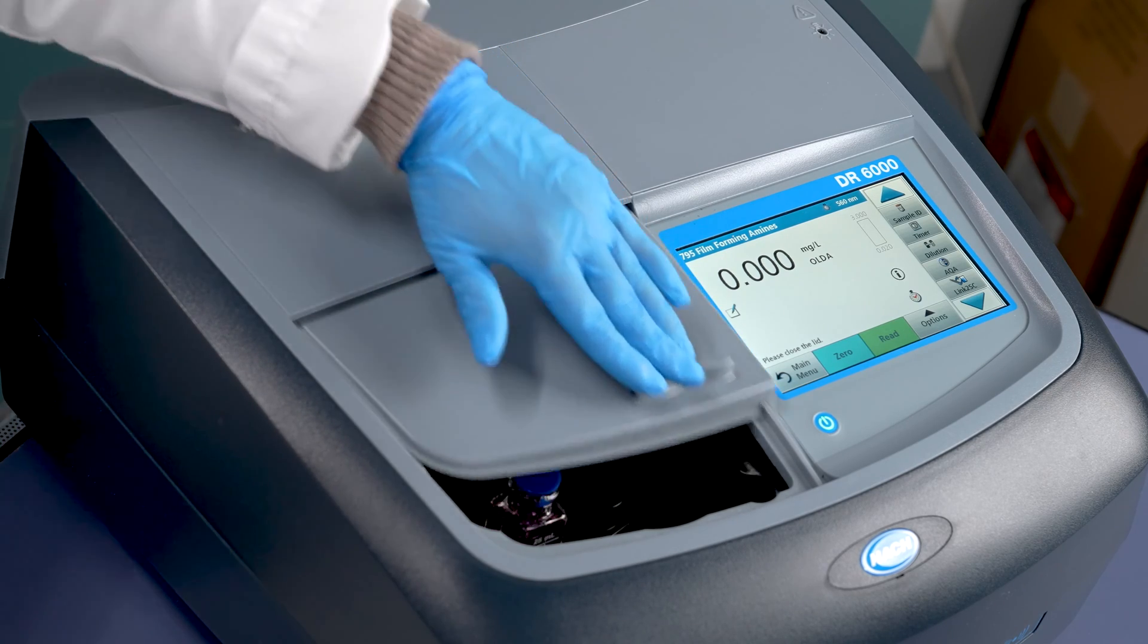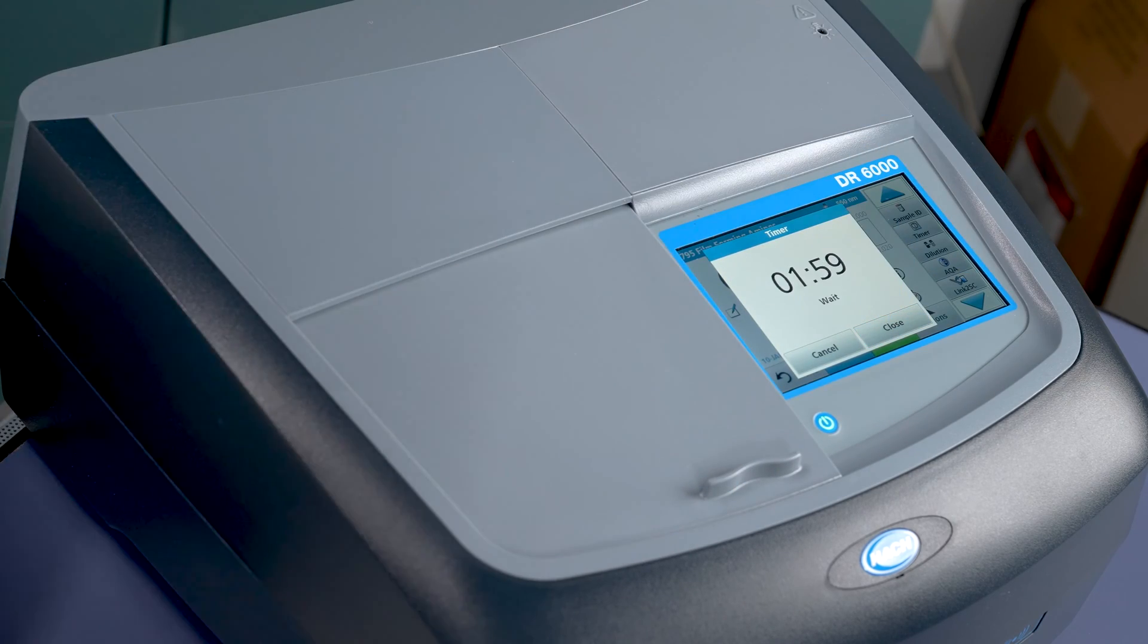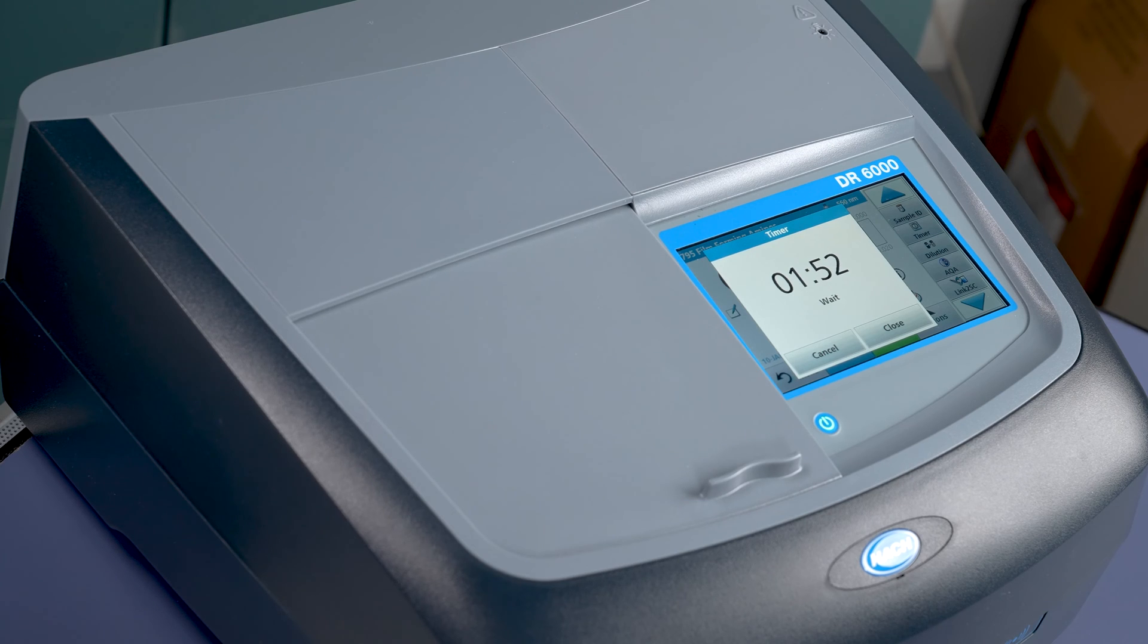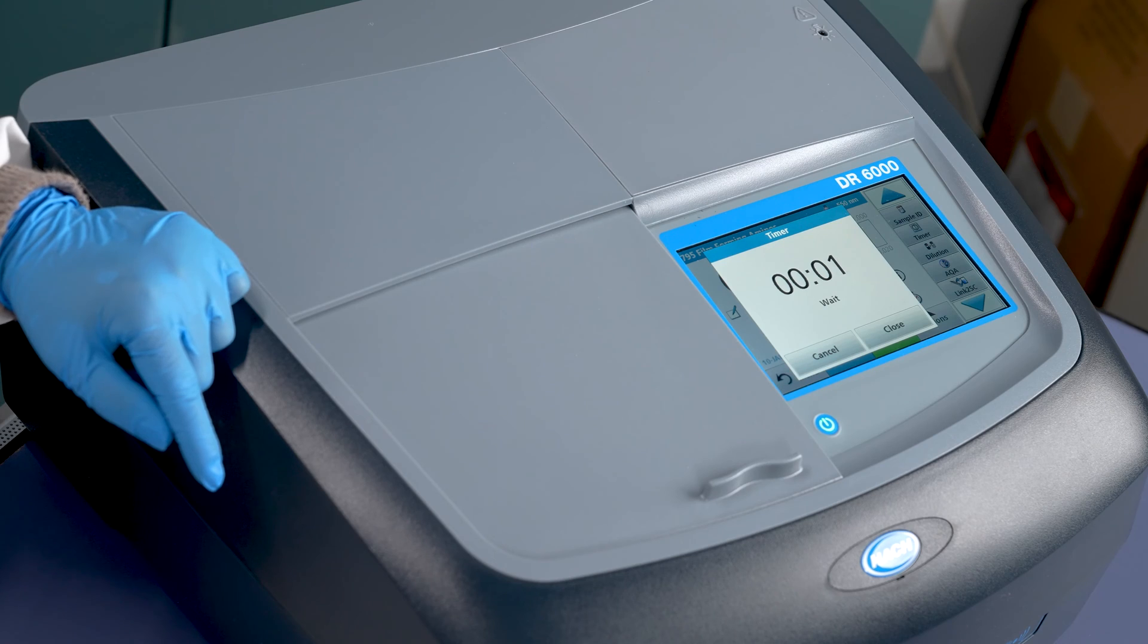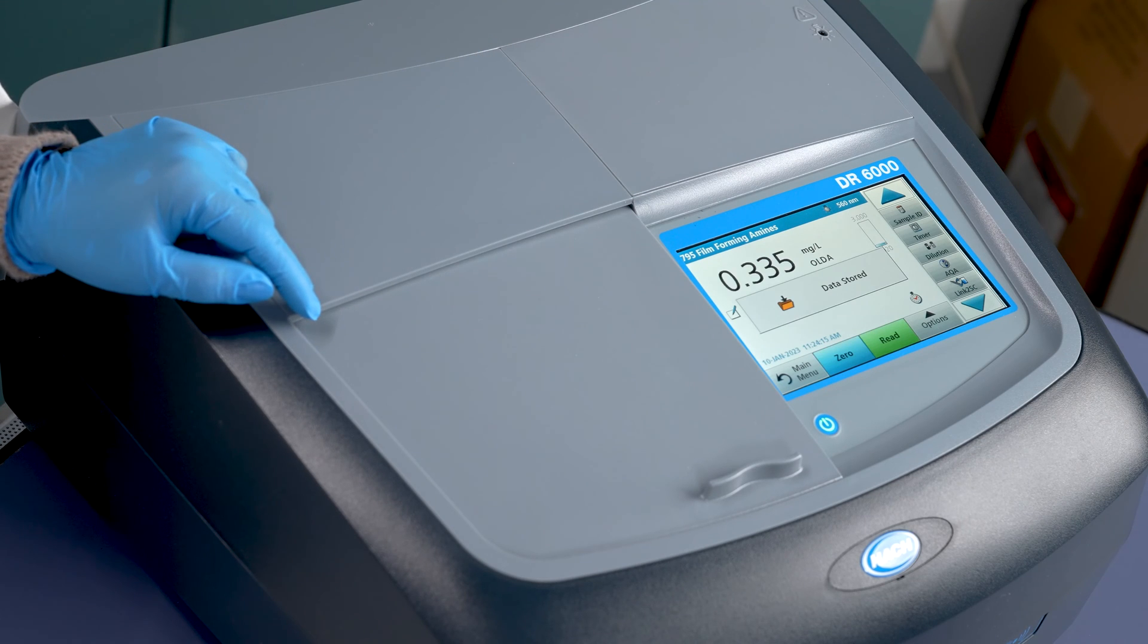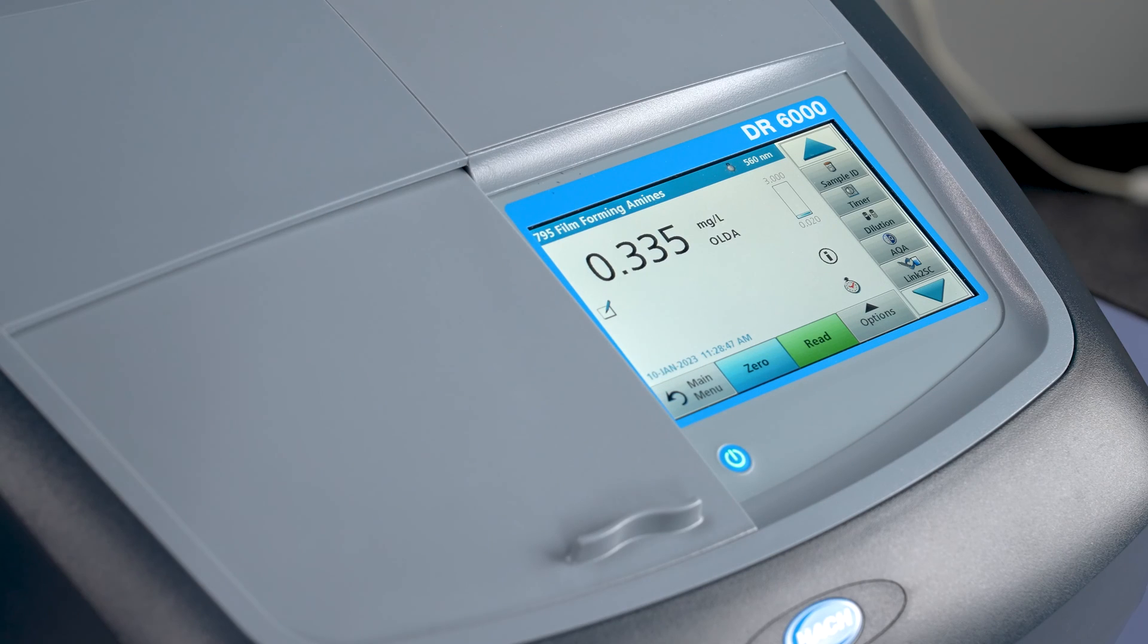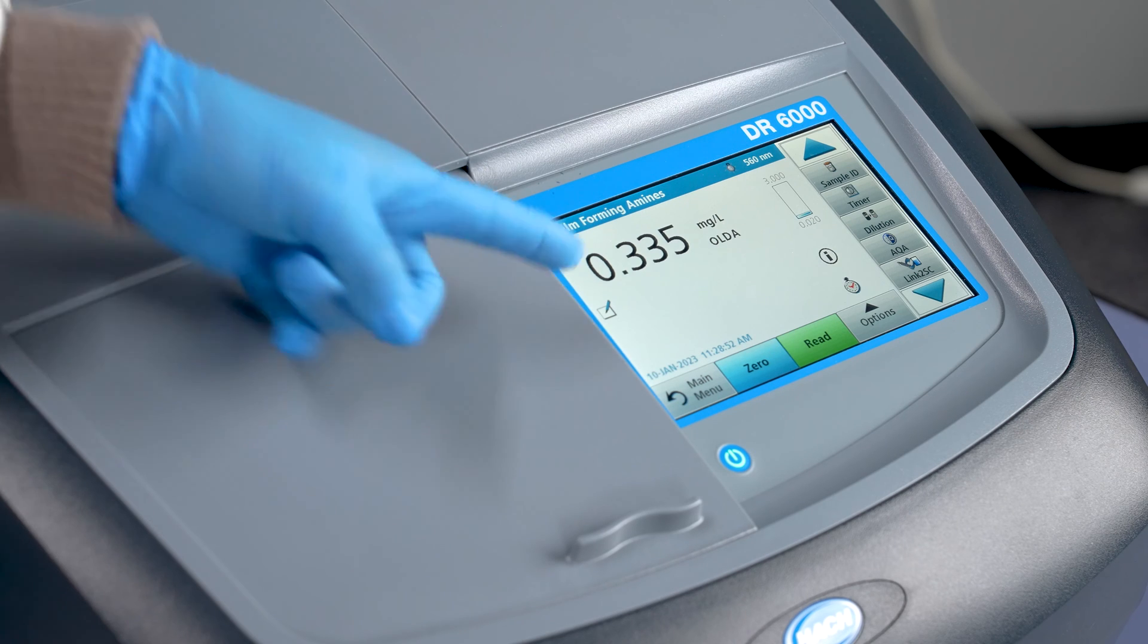As Tenista puts the sample cell into the spectrophotometer, it is very important to reiterate that the 25 mm mark is to face you toward the front on a DR6000. On a DR3900, it will face to the left. After pressing read, you will see the result of your method. As you can see, the reading is 0.335 mg per liter OLDA.